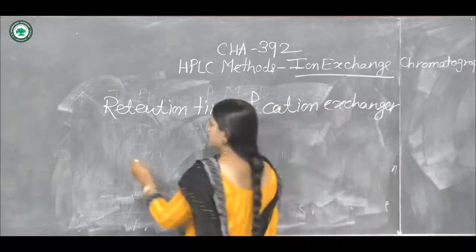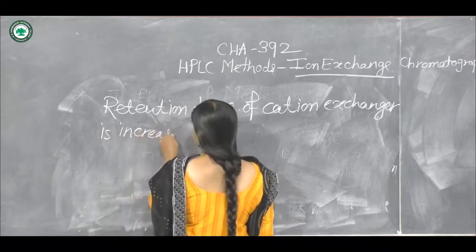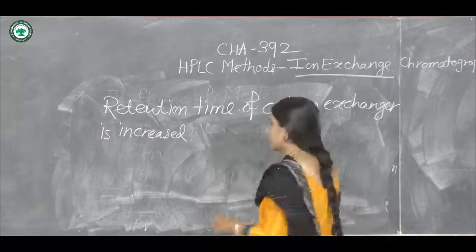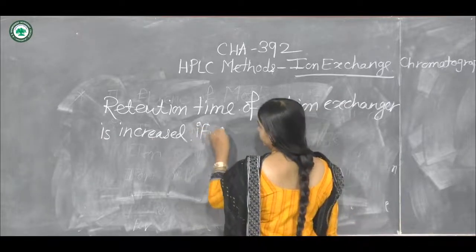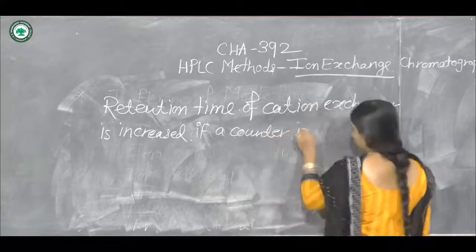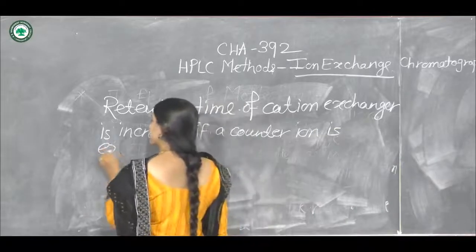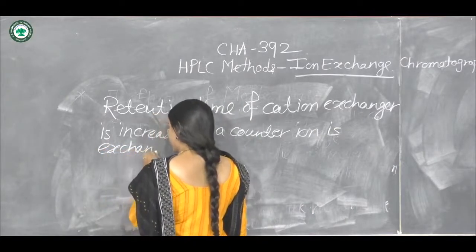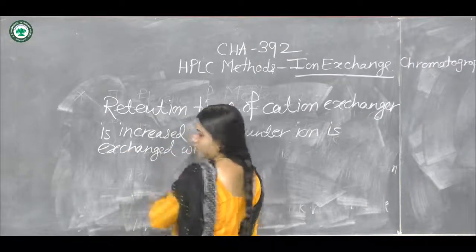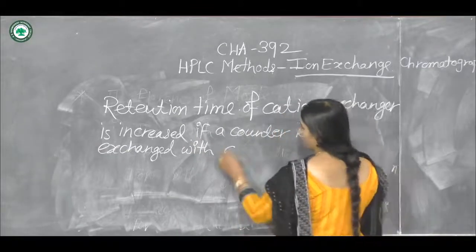It is increased if a counter ion is exchanged with another ion in the following sequence.